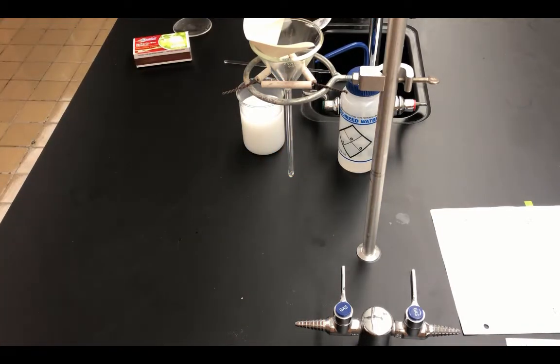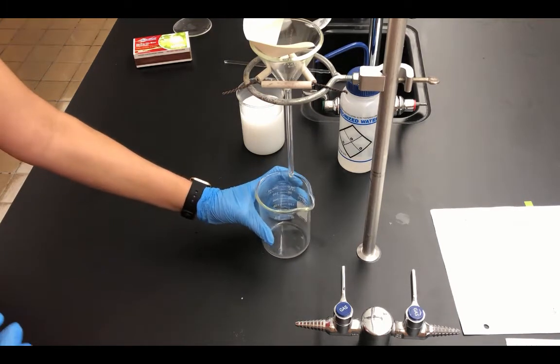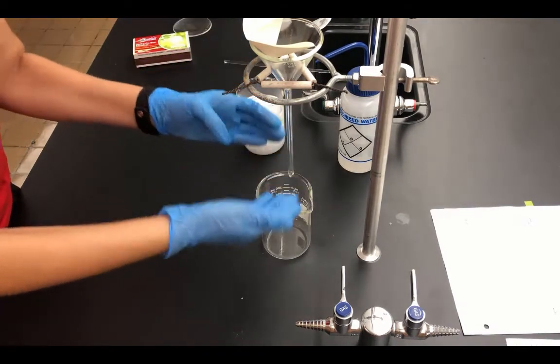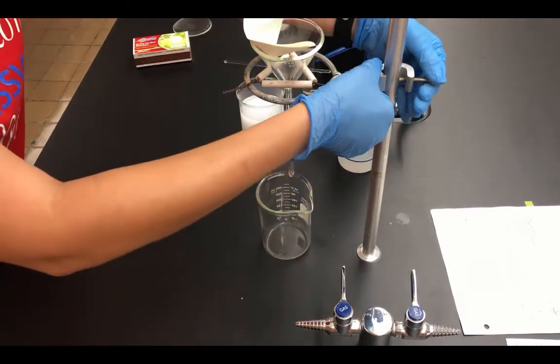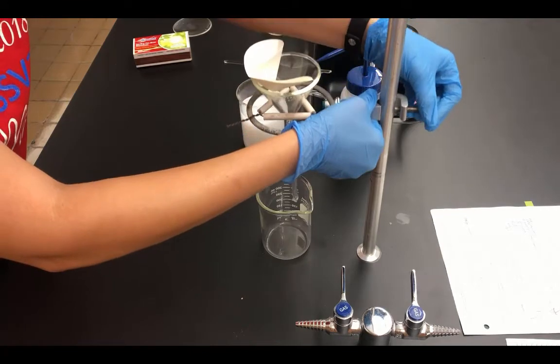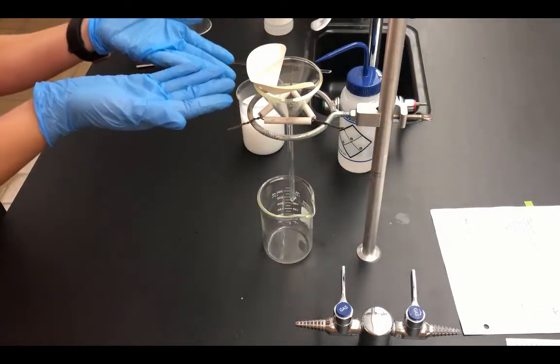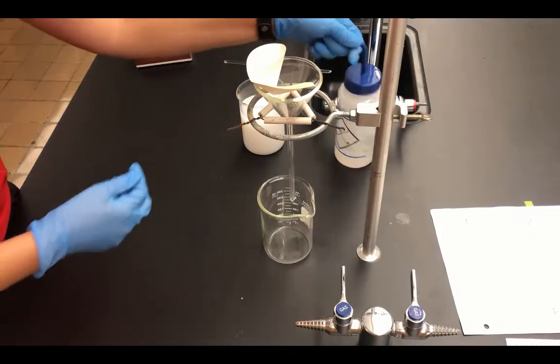So what I'm going to do is get an empty beaker to go underneath the setup. Now if it's up too high, it might splash out. So if you need to, you can lower it so that the stem of the funnel is in the beaker. Now notice how my paper is not staying in the funnel either.